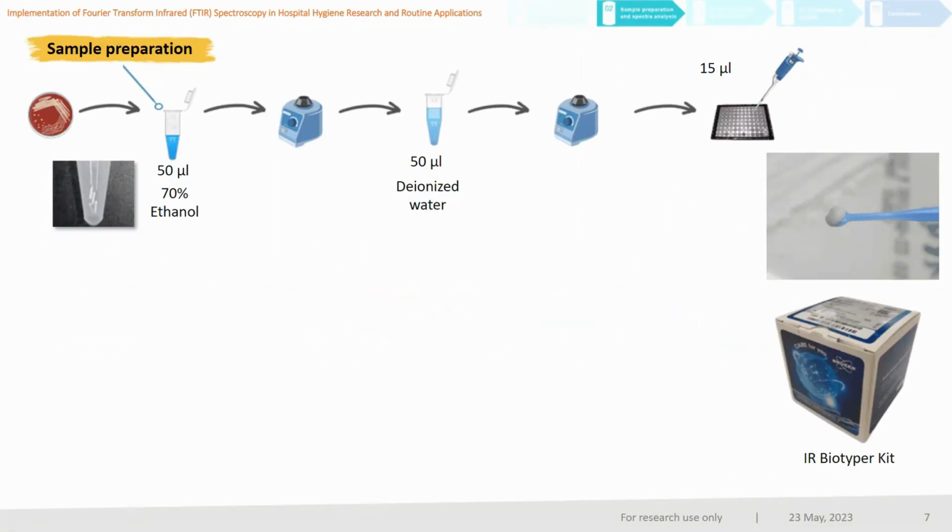Now, let's move on to the sample preparation process. If you have already worked with this technique, you are likely aware of its simplicity. Firstly, we need to resuspend the bacteria in ethanol and mix it thoroughly using a vortex mixer along with the metal cylinders of the tube to achieve a homogenized solution. There are two critical factors to consider during these steps.